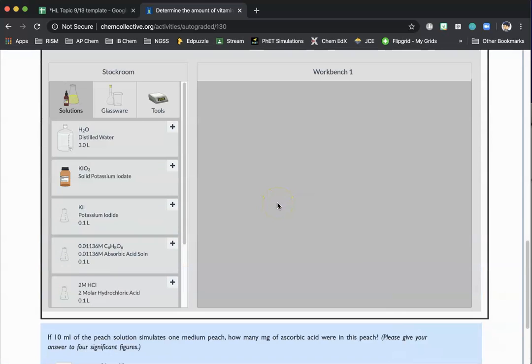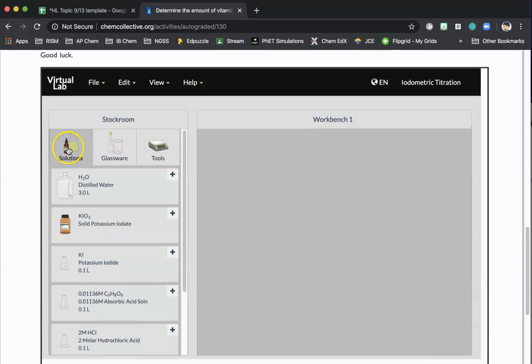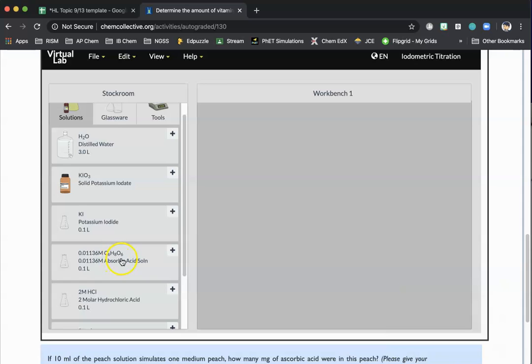Down to the bottom, you can enter your answer, and it auto-checks whether or not it's correct. Every time you reload this lab space, the unknown value resets and recalculates. Okay, so try to avoid refreshing or navigating away and coming back, because it resets and you'll have to start over.